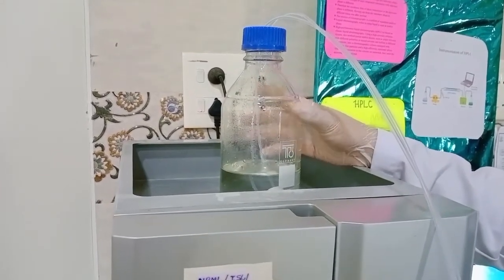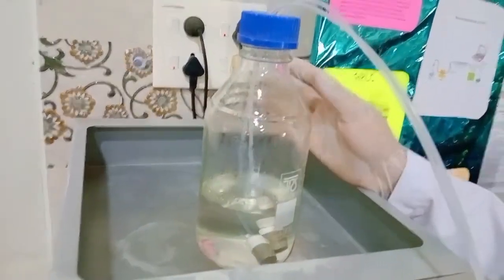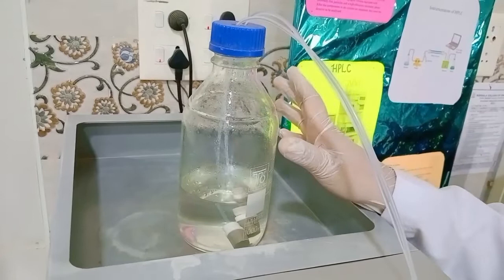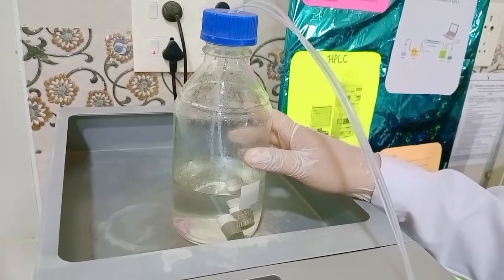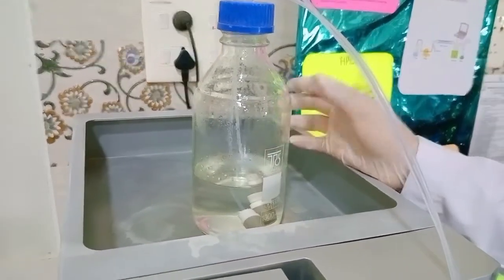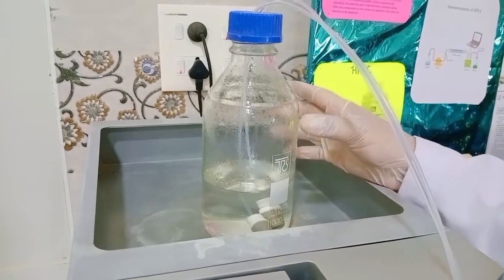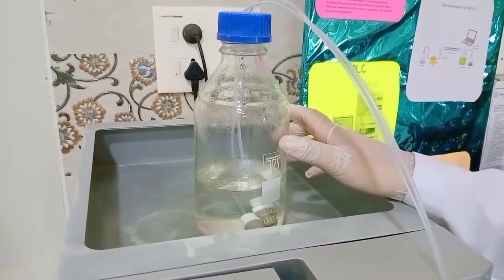A mixture of solvents or a single solvent is used as the mobile phase, based upon the nature of the chromatography, the nature of the stationary phase used, and the nature of the components to be separated. Before using the solvents as a mobile phase, they should be degassed. The degassing will be done in the ultrasonicator or in the vacuum filtration pumps. Why do we degas the mobile phase used in the HPLC? In order to remove the dissolved gases present in the mobile phase.